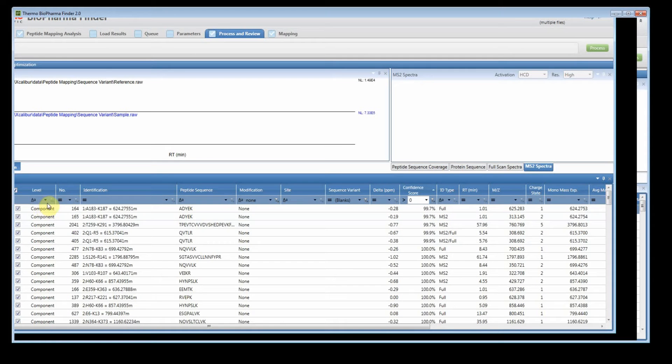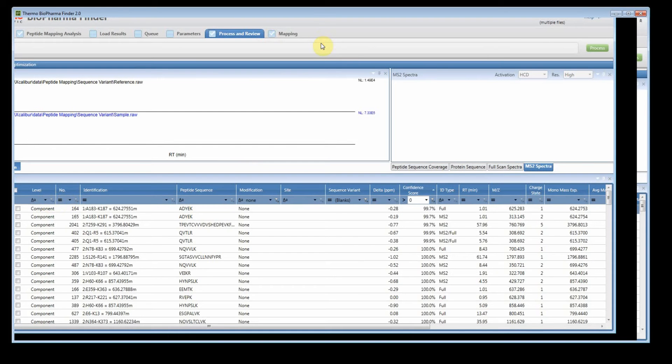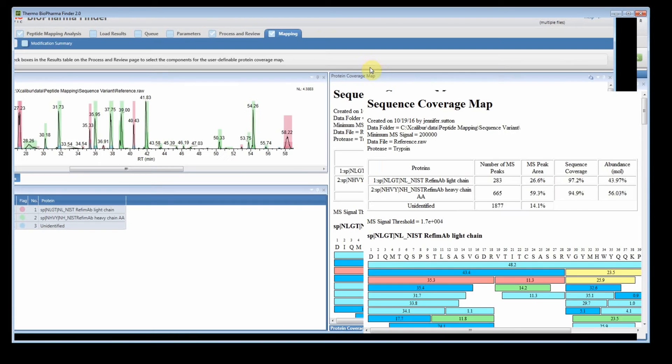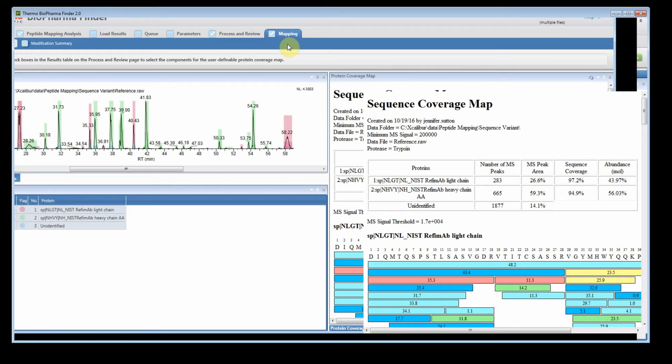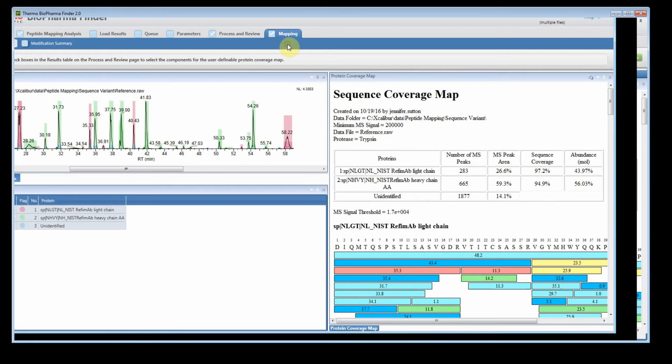So now what I'm going to do is I'm going to uncheck. When you uncheck and go back, it resets the coverage map to the default. So this is our default parameters now. It resets both of them. So we have 97.2, 94.6, or 94.9.